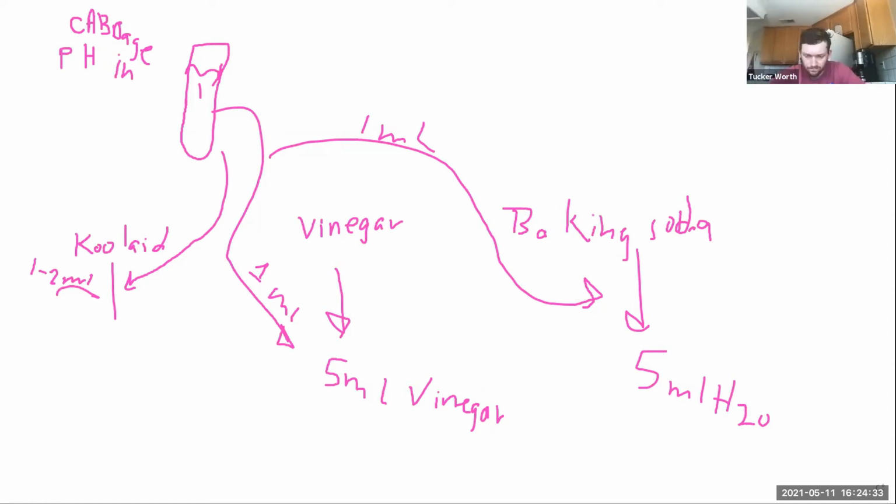Dr. Henry, if I got the 3 colors already, what's next? If you got the 3 colors for the indicator, that's all you need to do. You can let me know the colors, and then I'll put a key on the lab itself. I'm putting it up right now so that you guys can determine the pH.